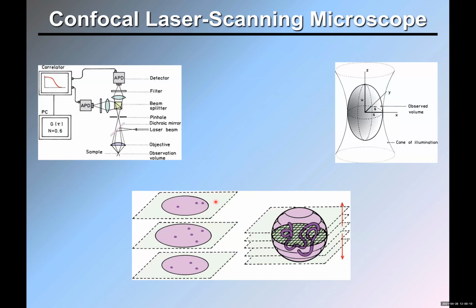Francisco, this imaging is mainly for solid samples, or it is not for liquid samples? No, you can use this also for liquid samples.